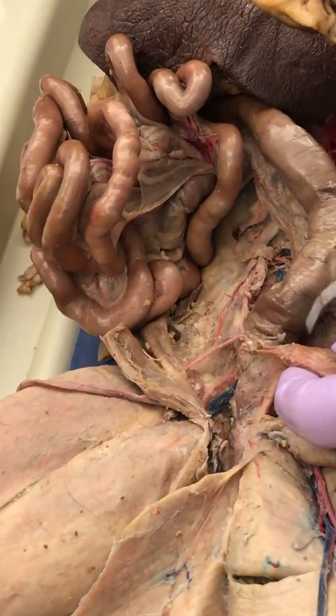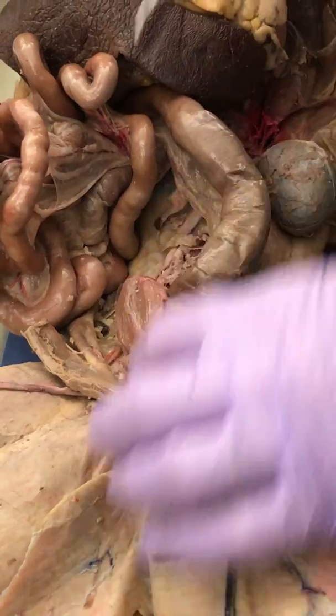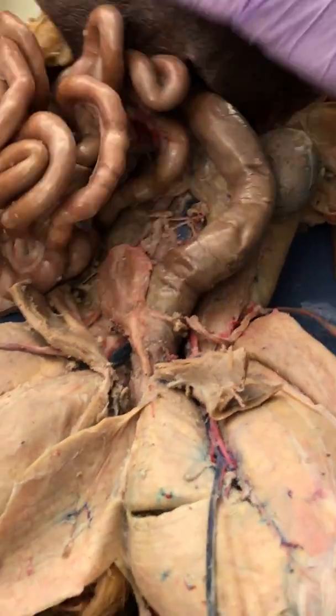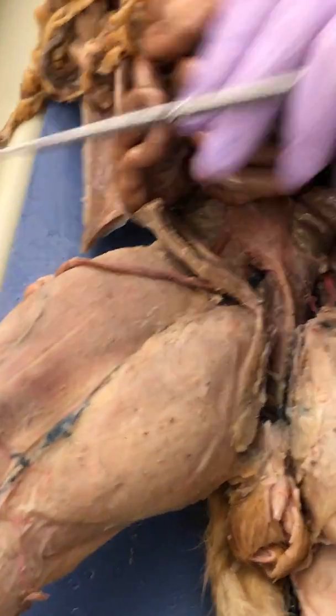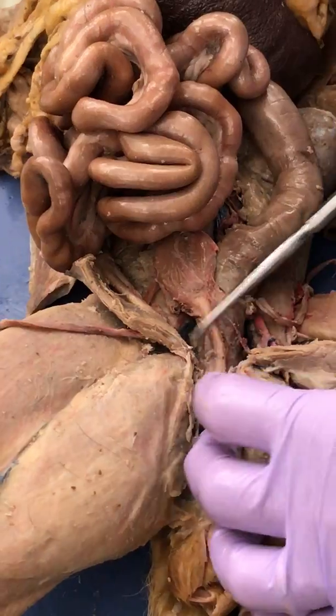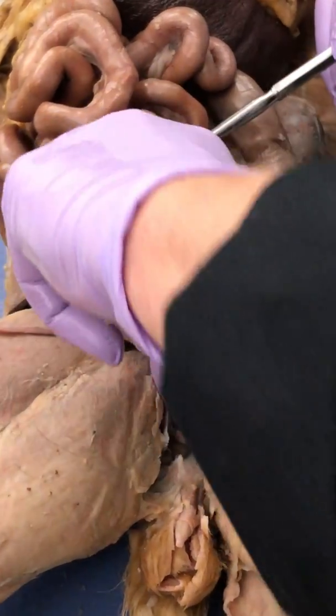What organ is this? Urinary bladder. So we have to call it urinary bladder? Yeah, because we also have a gallbladder. Okay, so what's this tube right here? Urethra. That's good. And did your guy have a little hard spot? Yeah, he does.